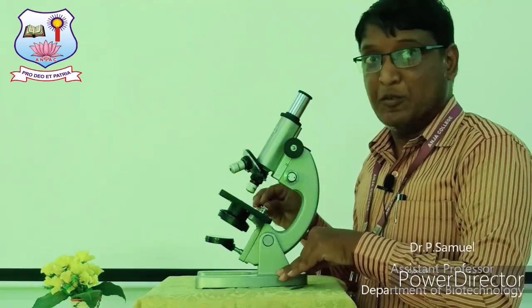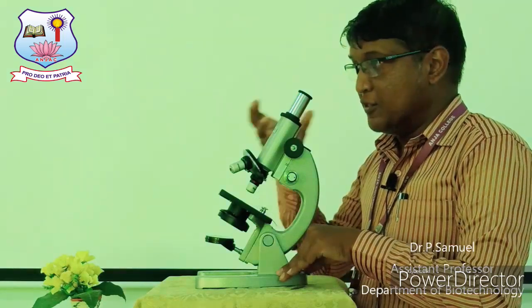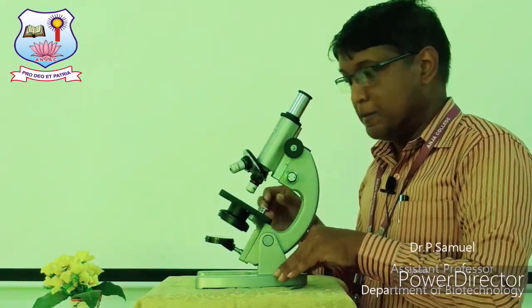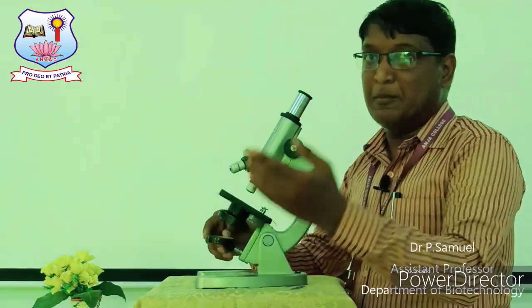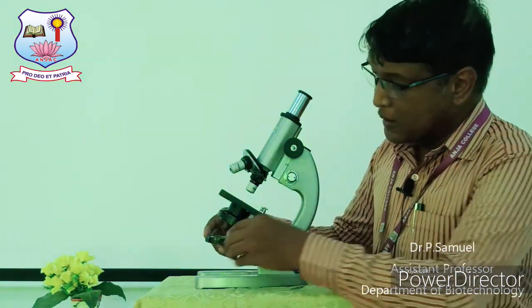There is another name for this microscope, called the light microscope, because a source of illumination is required, and this mirror is used to trap light from its source. The light may be natural light or artificial light, right?